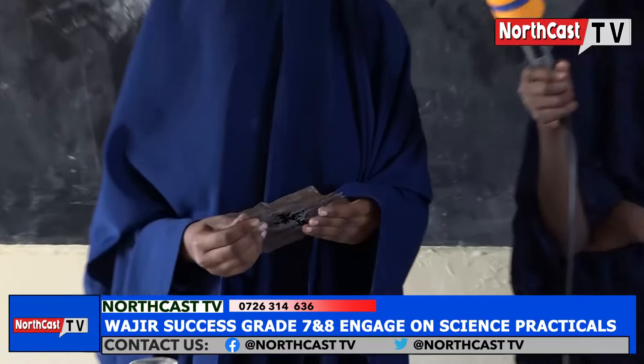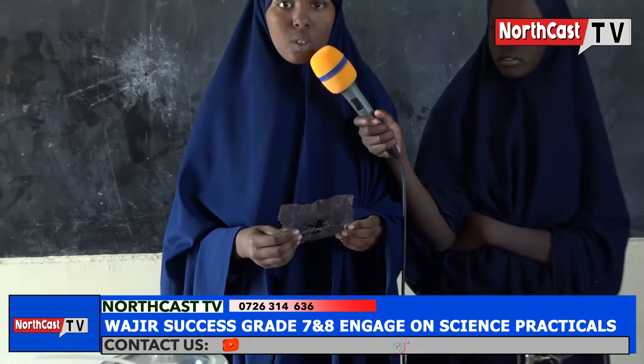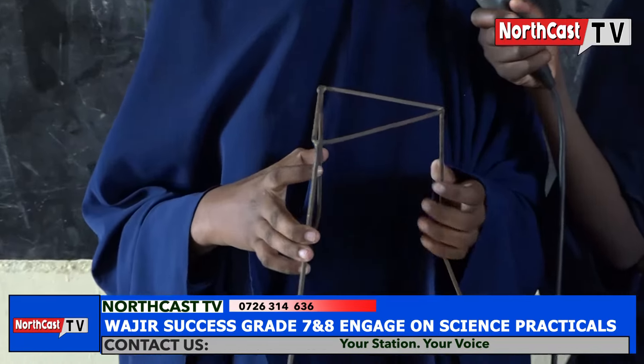This is a wire gauze. It is used to support beakers during heating. It is also used to distribute heat in glass beakers or flasks. This is a tripod stand. It supports beakers and flasks during heating.